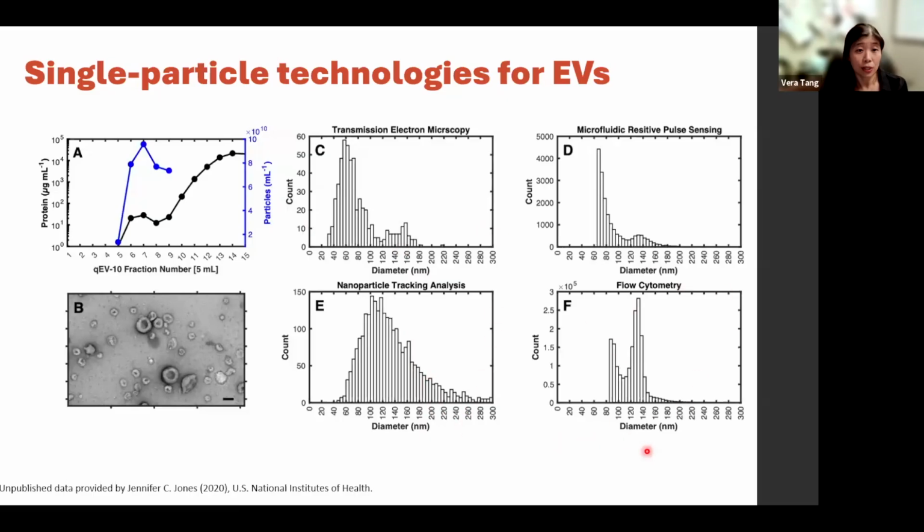And the surprise, and maybe not so surprising, outcome is that flow cytometry does a very decent job of the sensitivity as well as the resolution. And if you look at the other benefits of flow cytometry, the fluorescence detection and the quantitative aspects of it, it ends up being a good, well-rounded technology to analyze these extracellular vesicles. And hopefully I'll be able to convince you of that.